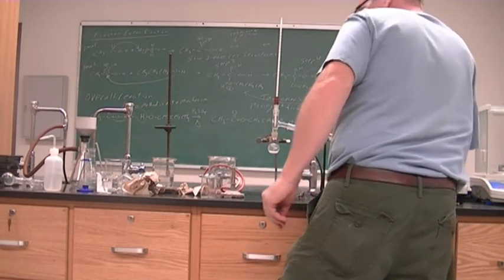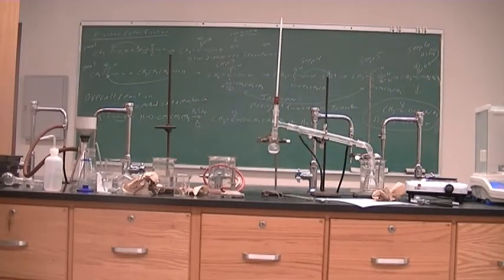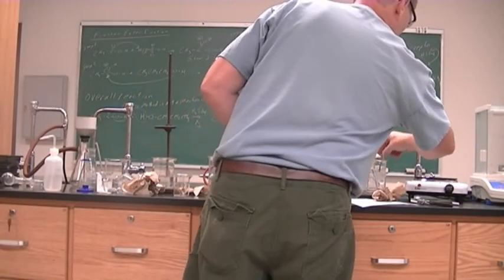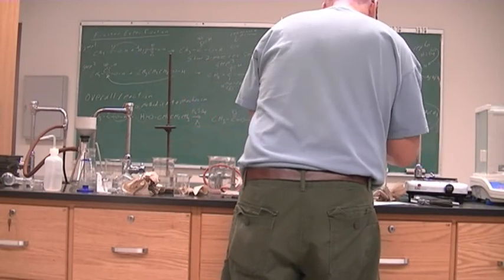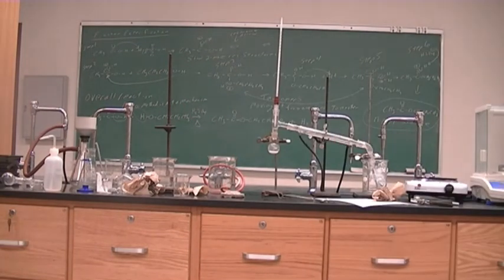Bottom at the top. Oh, we don't have it ice cooled. Let's get a couple ice cubes. All right, so now we have our ice cooled receiver.